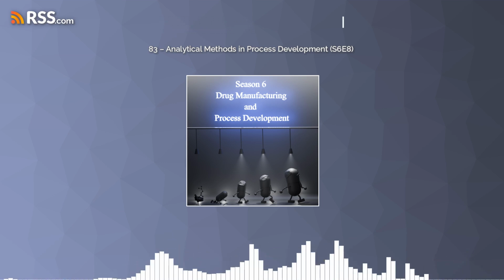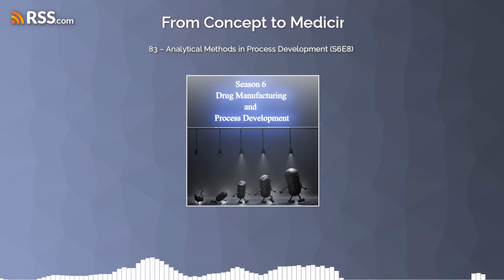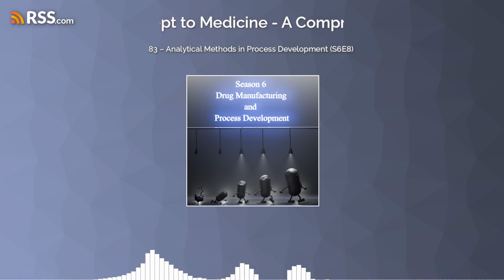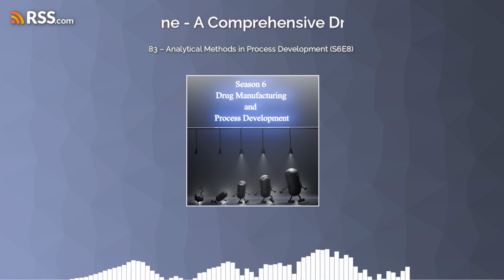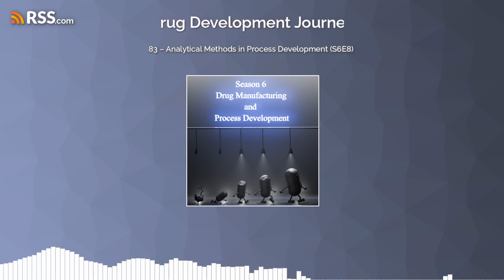This highlights that while we've talked a lot about HPLC and NMR, other chromatographic techniques like GC also play a really important role in process development. Because there's a whole set of tools. It's a whole toolbox, each giving you a different view into that chemical reaction.